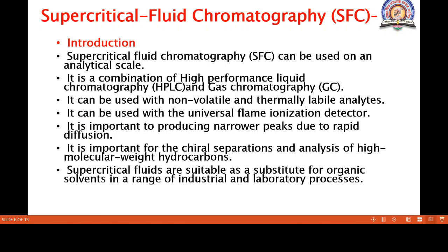Okay, so students, you have to remember from this slide, it is the combination of HPLC and GC technique. Then it is used with non-volatile and thermally labile analytes. Whatever matter we are going to separate, it must be non-volatile and thermally labile.